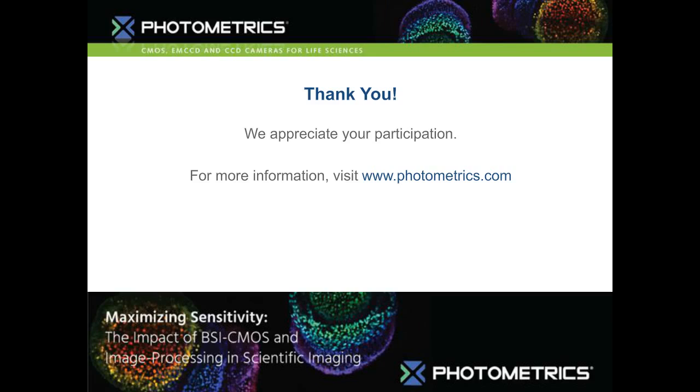Now, the advantage that the Prime BSI, or the binned 2x2 pixel, would have is simply that when binned, it becomes a 13 micron pixel, so 13 microns by 13 microns, while an EMCCD pixel is 16 microns. Oh, sorry, what I mean to say is the EMCCD pixel would still have a bit of advantage there just because of the larger pixel area.